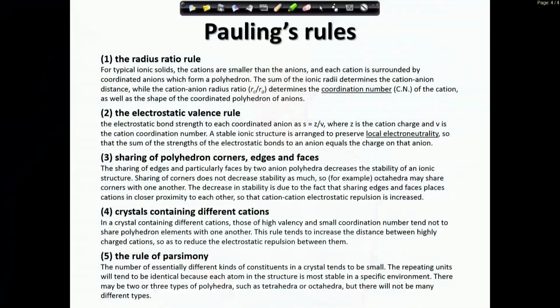And because this workshop deals with inorganic structures, we will focus on the validation of inorganic materials, and the basis for the structure description of inorganic materials has been set by Pauling with his famous Pauling's rules. And this is a little overview of these rules. These are not laws, these are rules, and rules are there to be violated. So there is always an exception to a rule, but they give a reasonable starting point, and if you see a deviation from the rule, it's good to double check that it's really a real violation and not just a mistake in the interpretation or mistake in the structure.